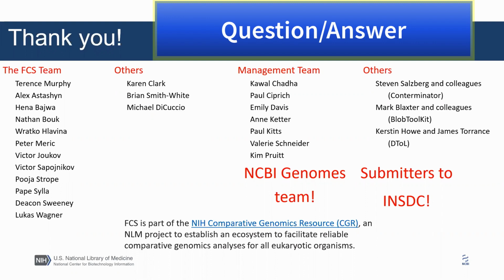Right. You mentioned, so there's a couple of things. The GX database, that sounds like that would be really cool for a BLAST database. It'd be nice if we had it available for that, but that's another topic. Also, you mentioned downloading it from the FTP site. Is it not available on the cloud providers? We're currently working on that. That's one of our next steps. We've received some feedback in terms of the download times and are listening to that. And so one of the next steps in the more immediate future is going to be making that available on cloud services.